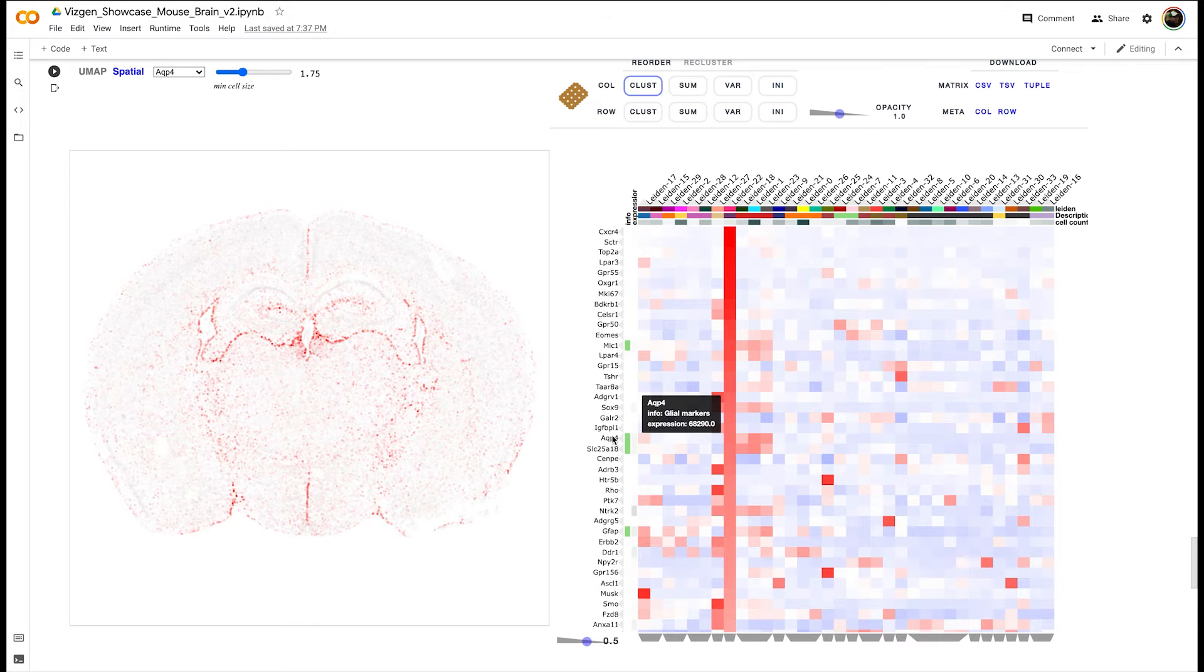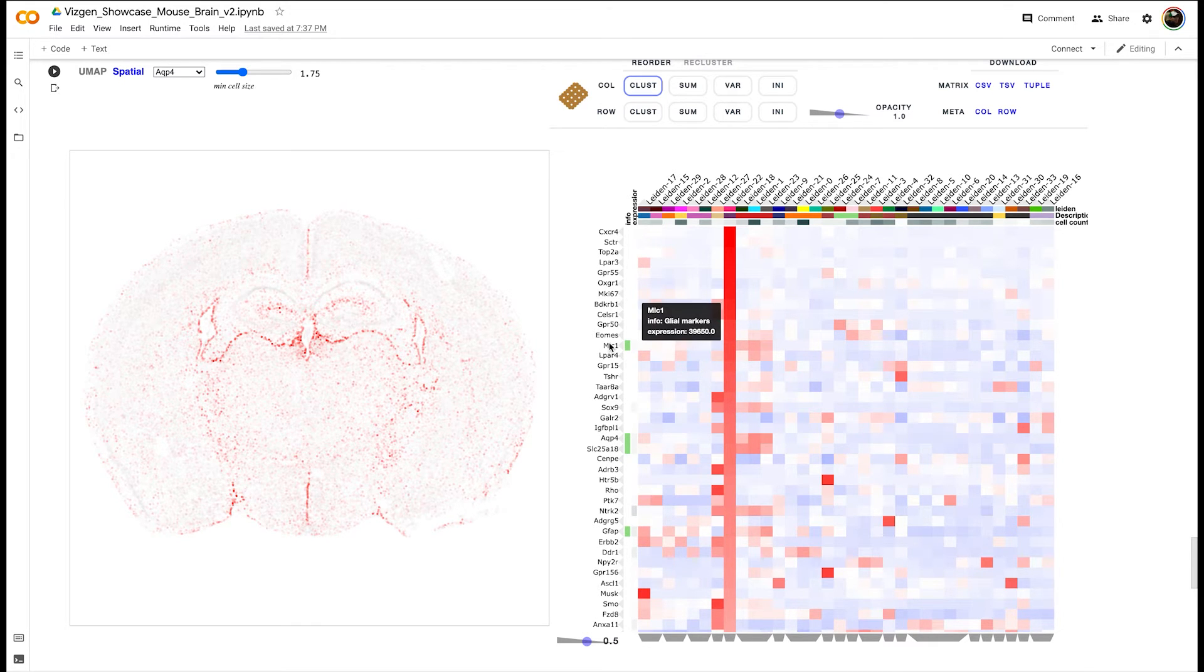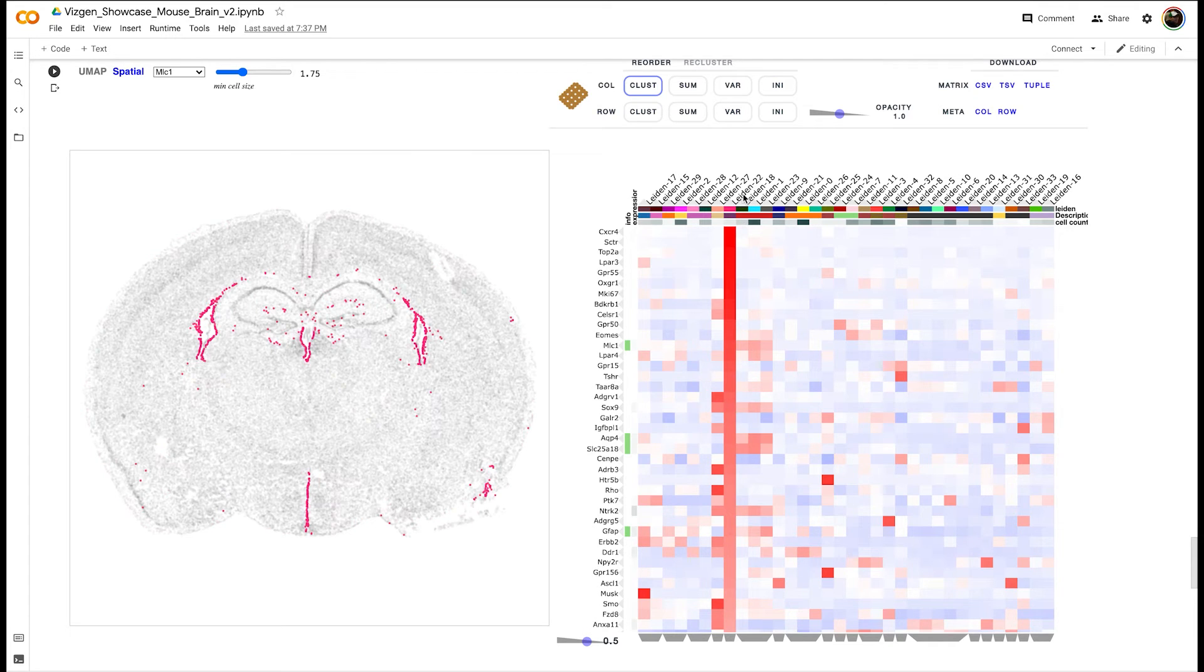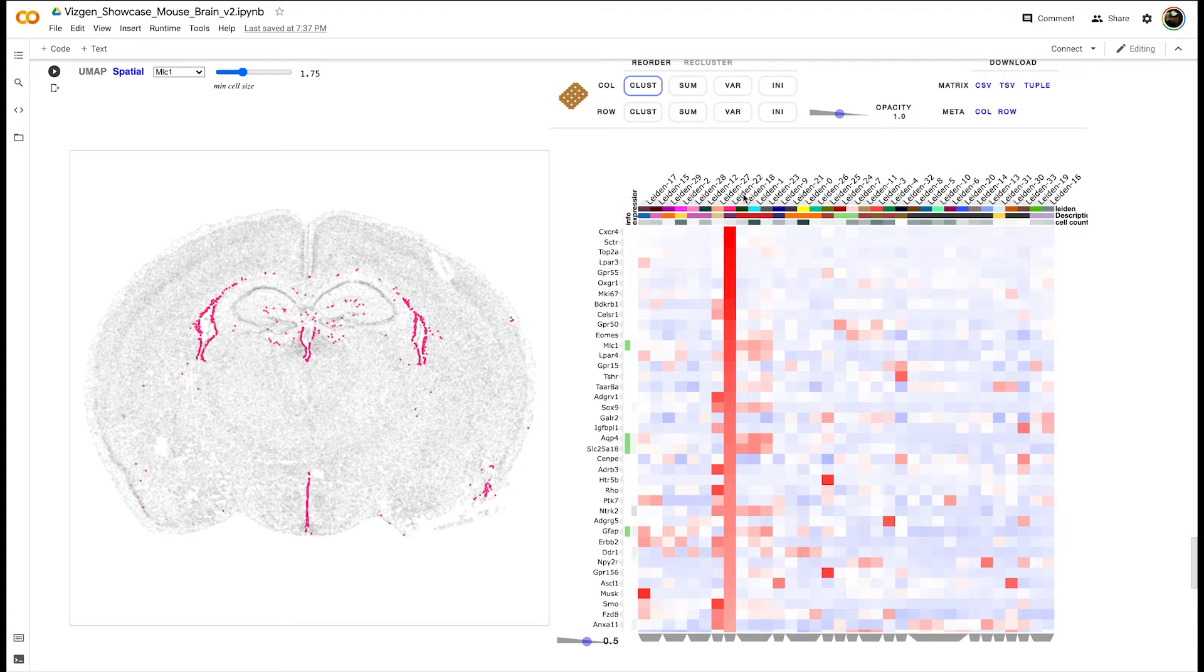To varying degrees these genes are demonstrating gene expression according to the spatial localization of cluster 22. This is where we would expect this cluster to be expressed in the brain ventricles, so this agrees with our prior knowledge.